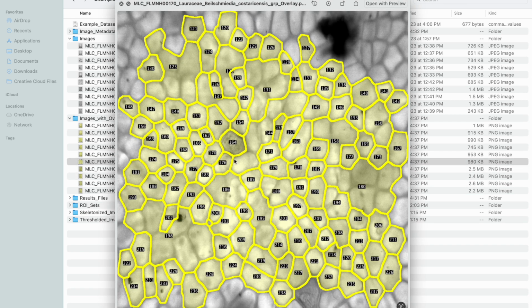We can qualitatively assess how CuticleTrace has done here, and we can see that in most cases it is selecting one single cell and outlining that cell accurately, but in an image like this, there are definite clusters of cells that get piled into one ROI, that would screw up our statistics and our morphological information if we didn't filter them out.